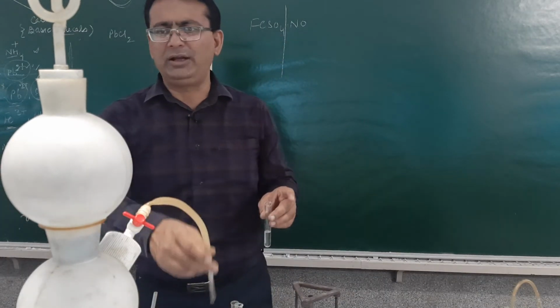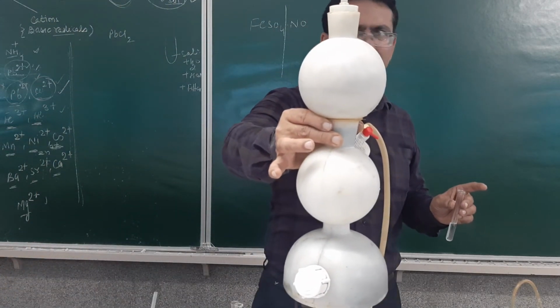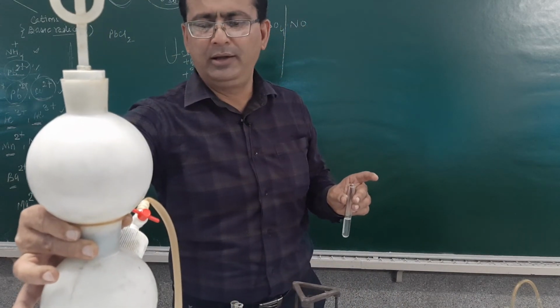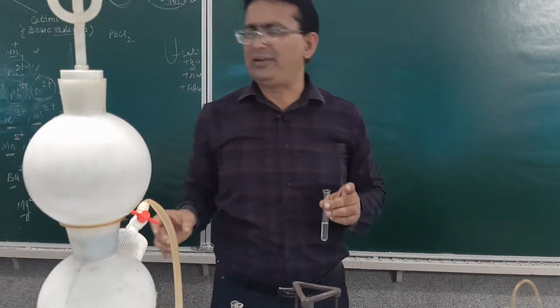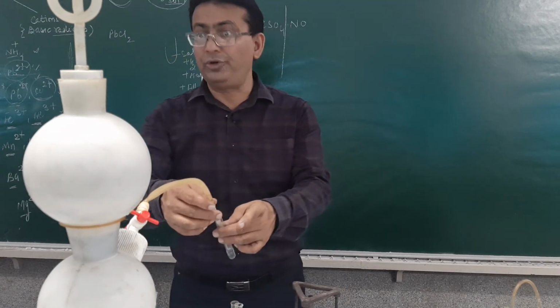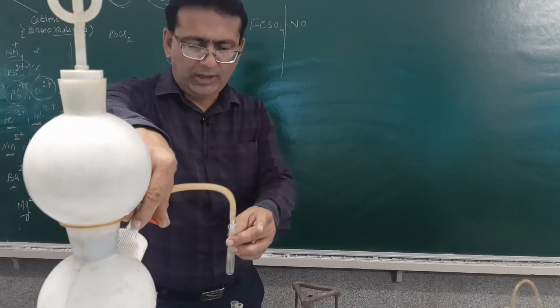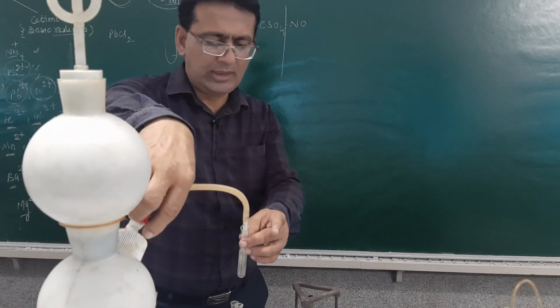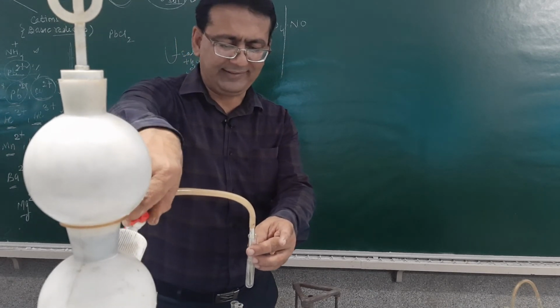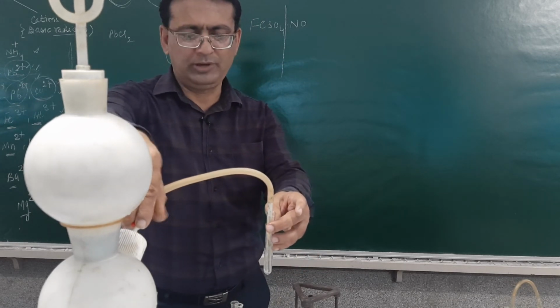You may see over here how to pass H2S gas. This is hydrogen sulphide. This apparatus is called the Kipp's apparatus. You have seen in the lower classes, in which we add zinc sulphide or iron sulphide and add acid into this, so H2S gas will be given out. Now through this filtrate, you may also take the original solution if the first group is absent, you pass H2S gas. On passing H2S gas, just see.